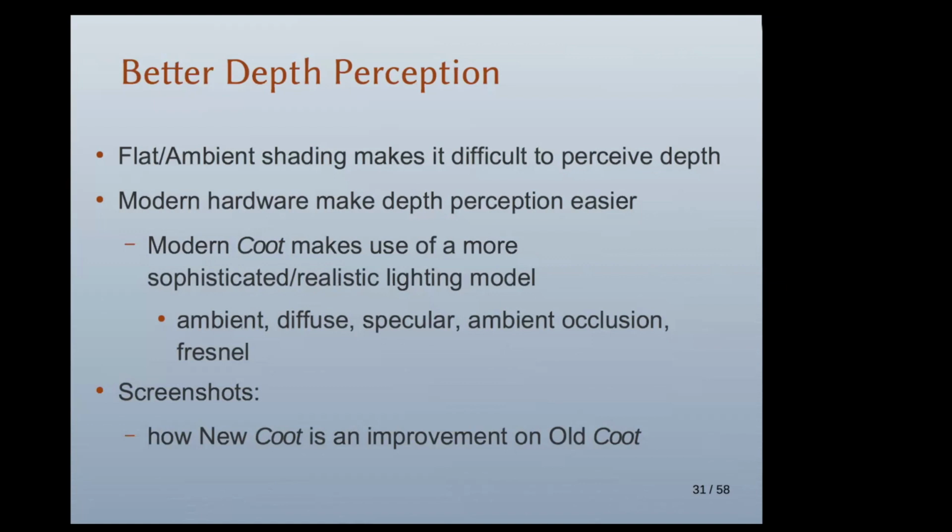It looks gorgeous, and Coot doesn't look as gorgeous as ChimeraX does. The ambient occlusion brings something to the party in Coot, but it's better in ChimeraX. I often shake my head and wonder how they did it so quickly and so beautifully. Also, shadows in ChimeraX improve the representation, and they're not at all represented in Coot. Maybe some things for the future.